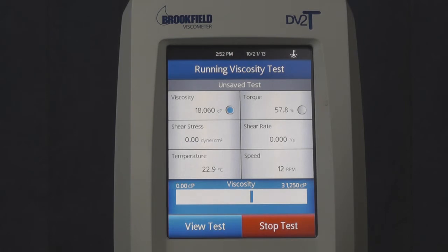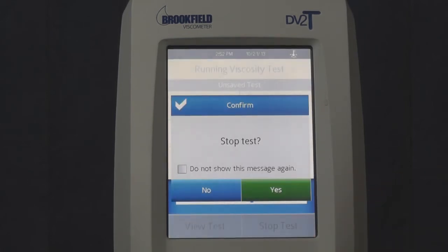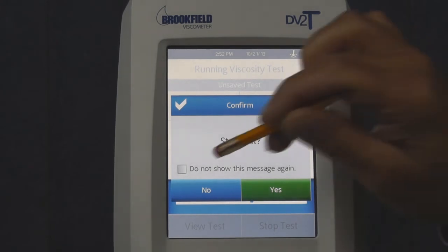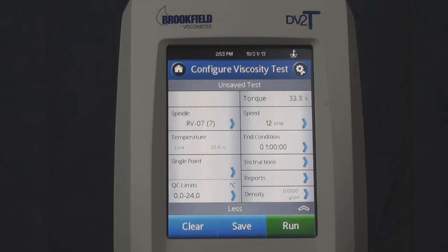In this case, I want to stop a test before the end condition has been met. When I touch stop, I am asked if I want to stop the test. By checking the box 'do not show this message again' and then yes, the next time I touch stop to end a test, I will not be warned and the test will end.